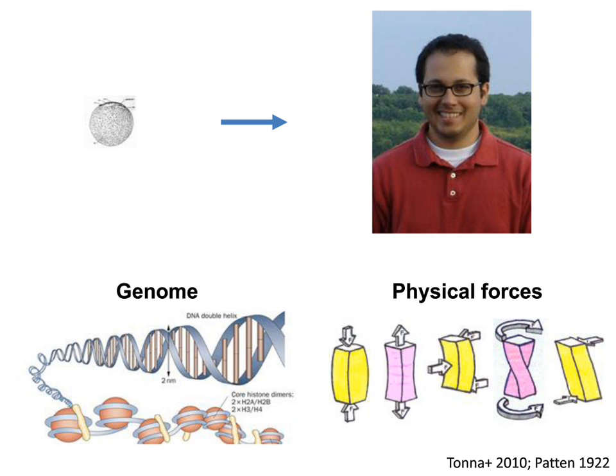So understanding the molecular and genetic factors that control physical forces to form the embryo is the focus of my work, and it's through studying this that I've been able to apply the NEPA gene electroporation system, and I'm going to talk about how that system was optimized for my particular purposes today.